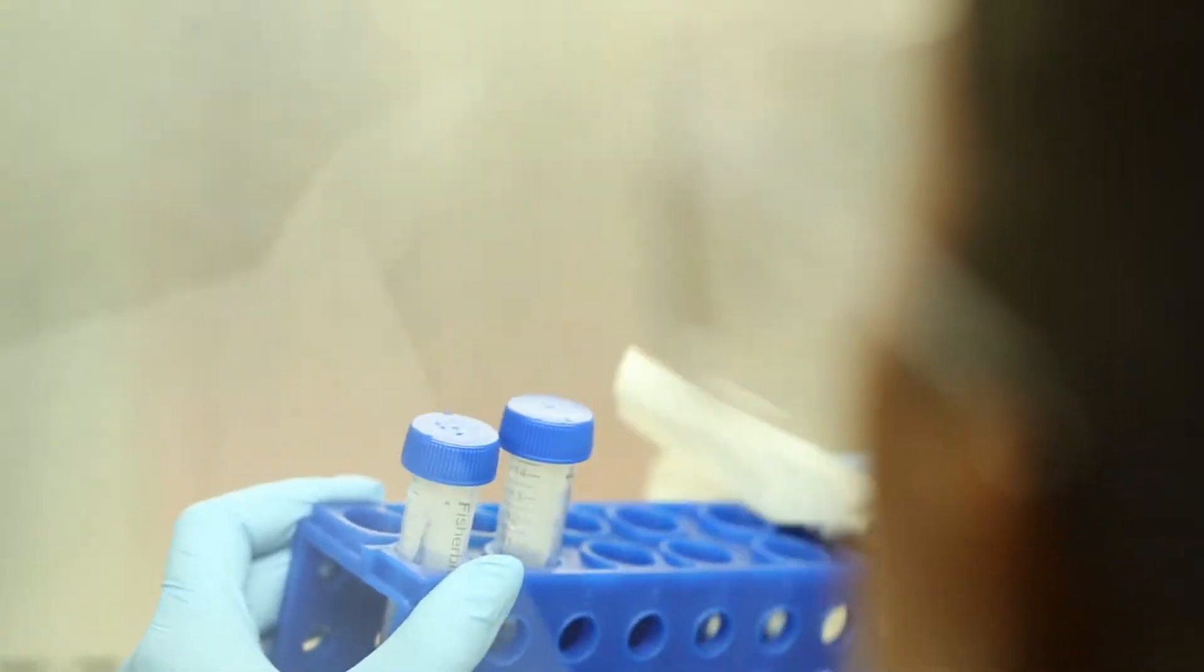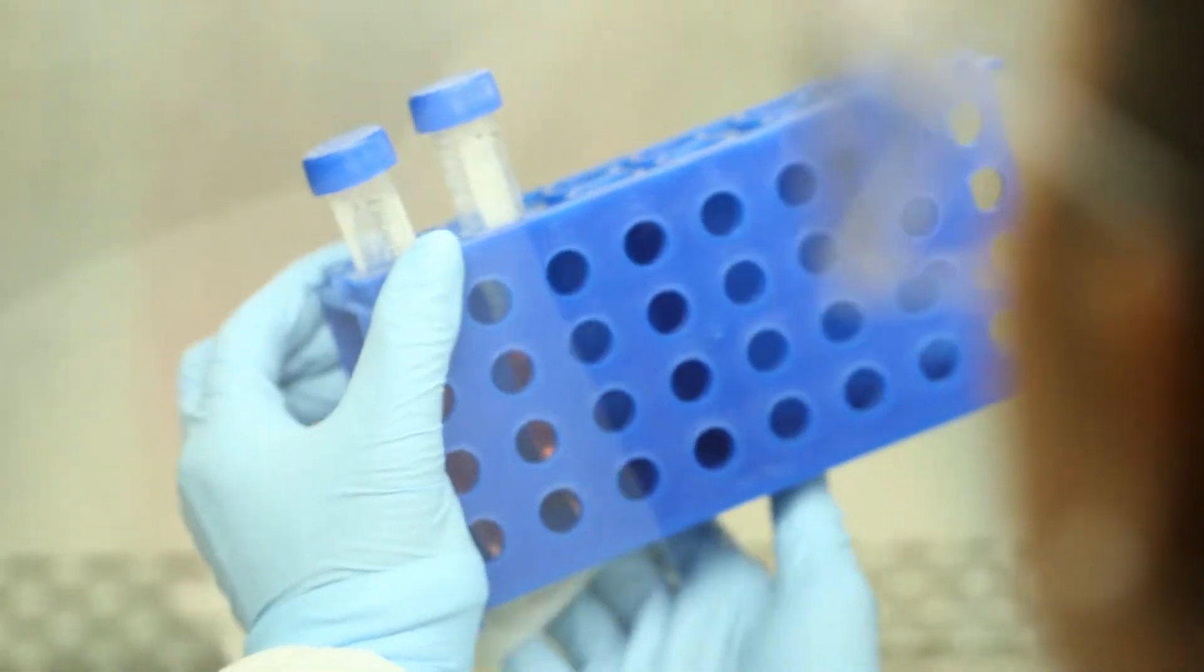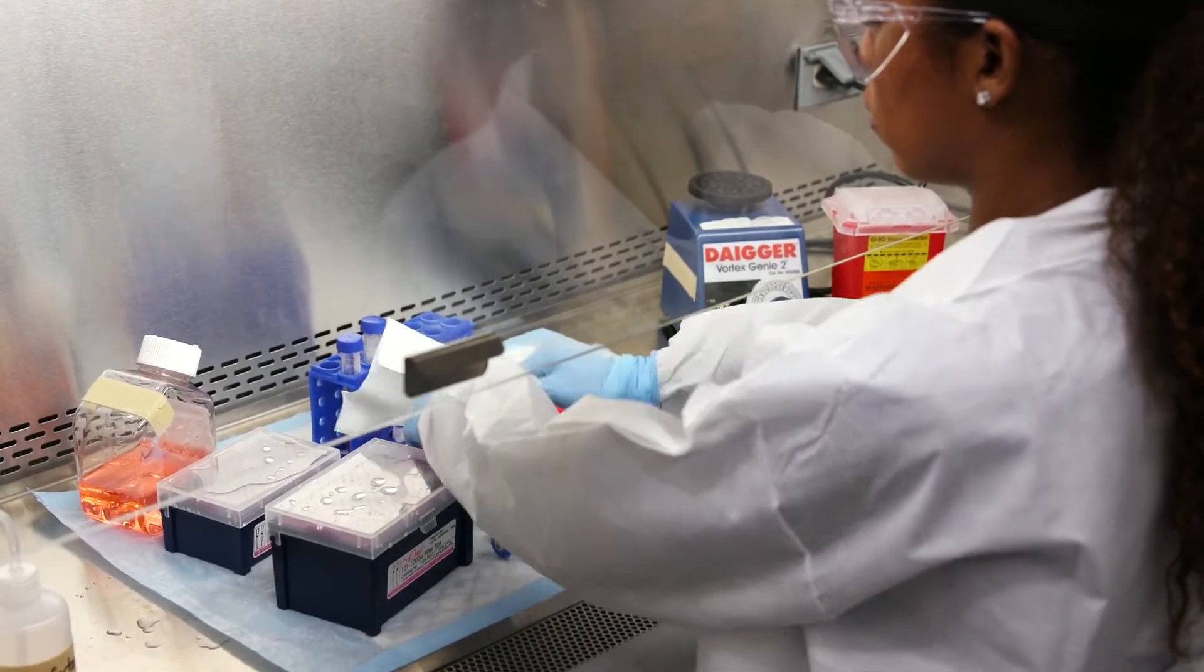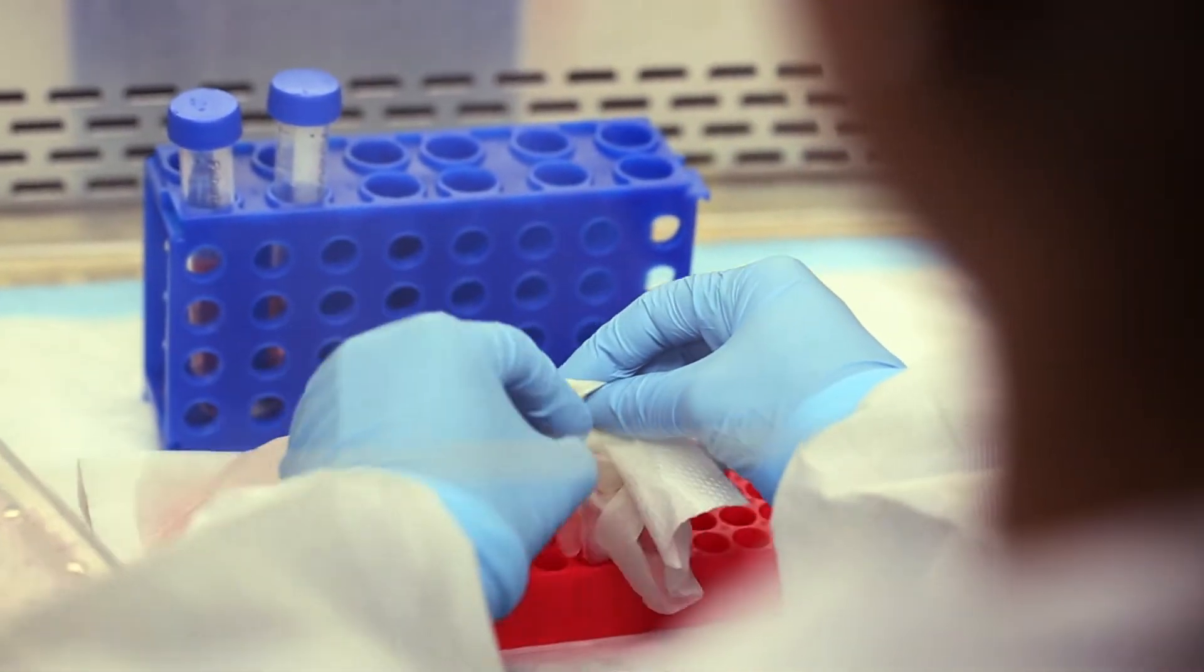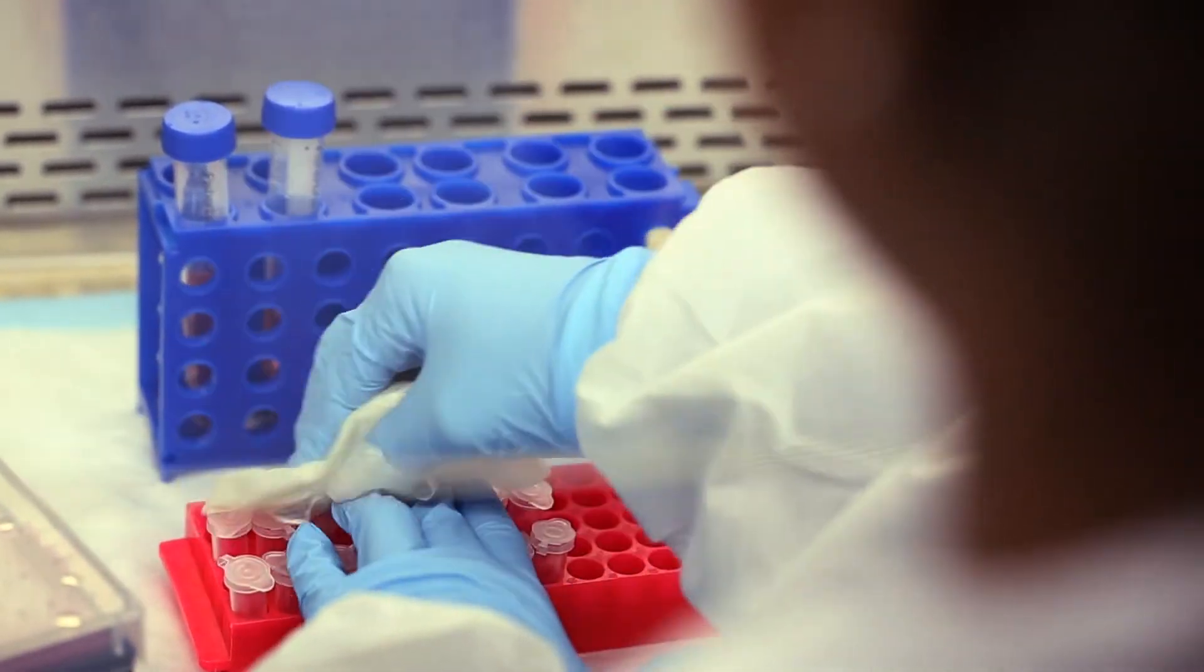Please note, samples should be surface decontaminated or placed into secondary containers that have been surface decontaminated prior to exiting the cabinet.